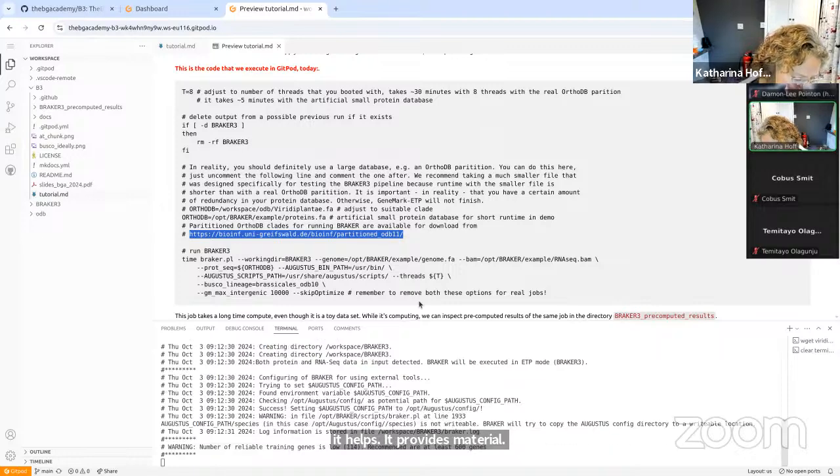I get a bit confused by OrthoDB 10 or 11, because BUSCO and OMArk are still using ODB 10. How can you compare the output of BRAKER?